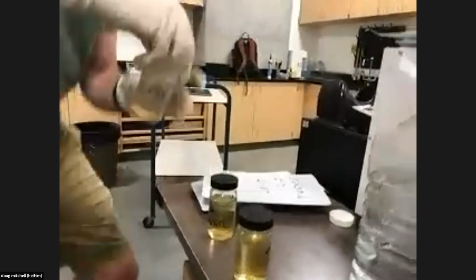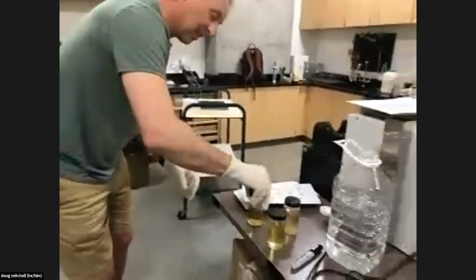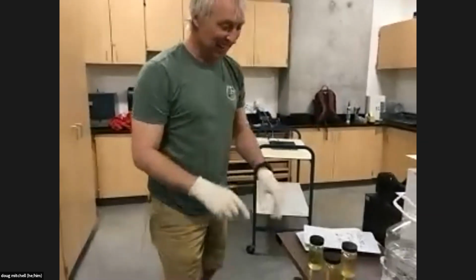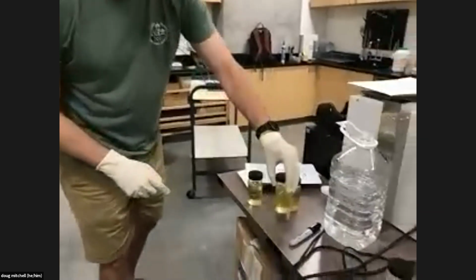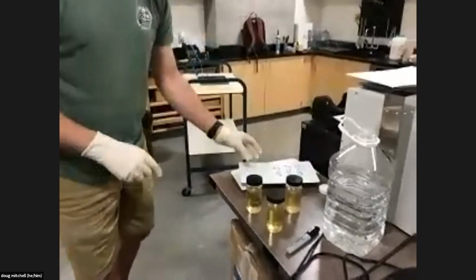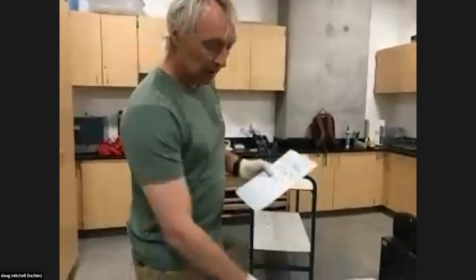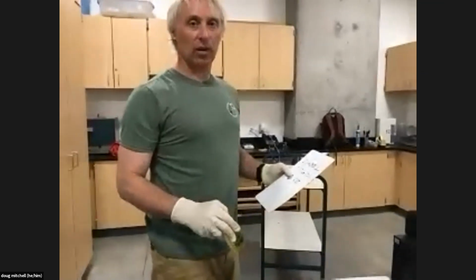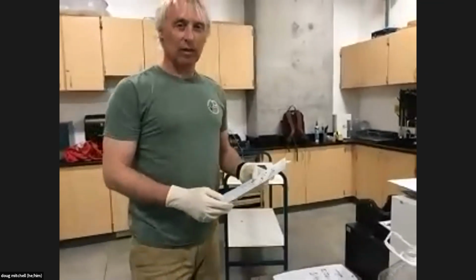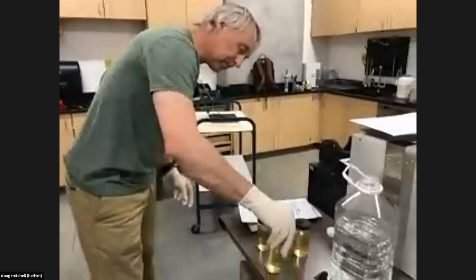When we do this with students, it's a pretty big effort to keep fingers out of the inside of the bottles. They seem to really want to put their fingers on the lips of the jars, but we don't have too much trouble with that when we do it on our own. But I'm actually surprised. I've never had a control sample actually show any bacteria at all. So that's actually probably a pretty good reference that we're doing things in a way that is sterile.